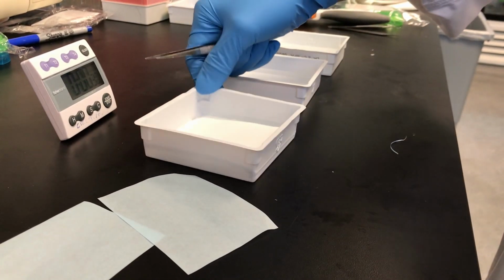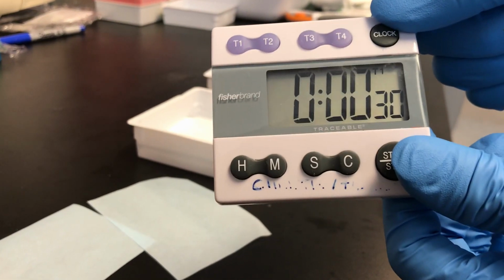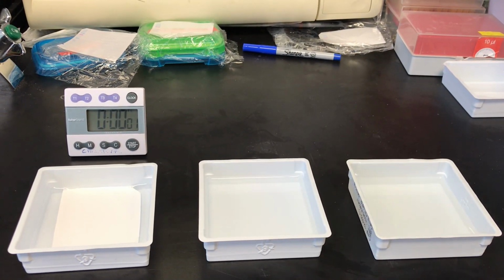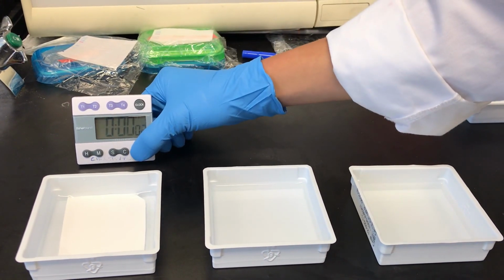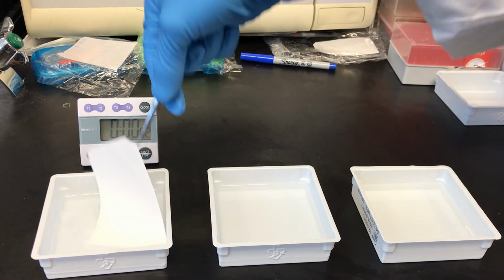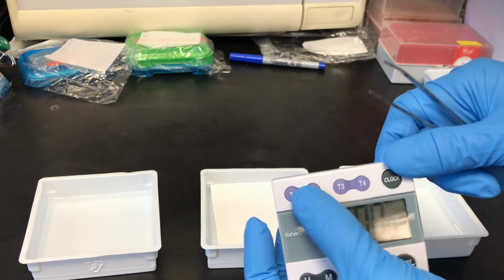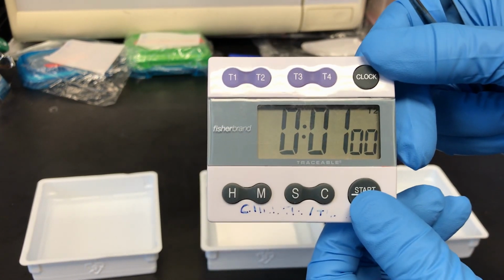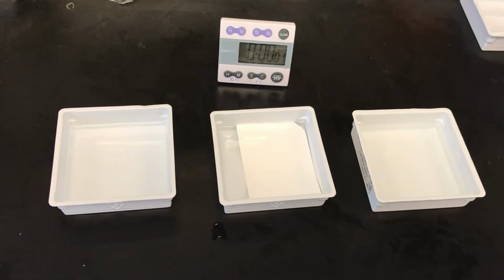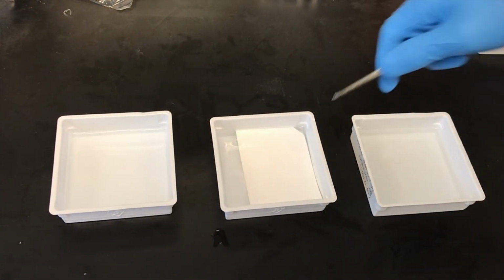Soak the membrane in methanol for 30 seconds. Wash in water for 1 minute. Finally, place in transfer buffer until ready to use.